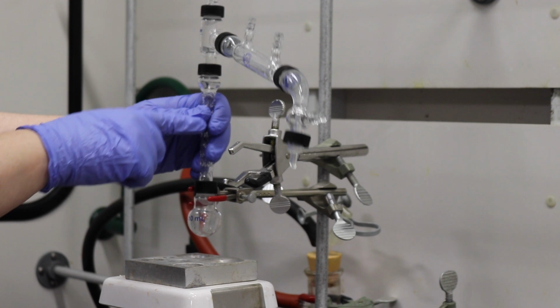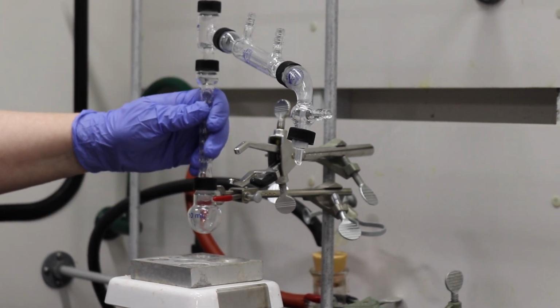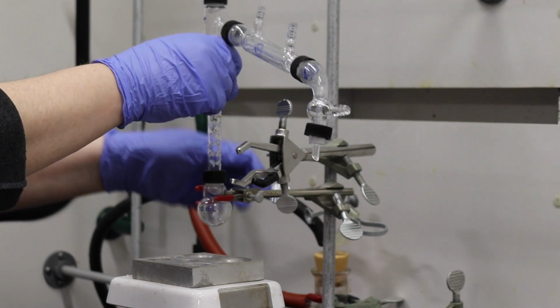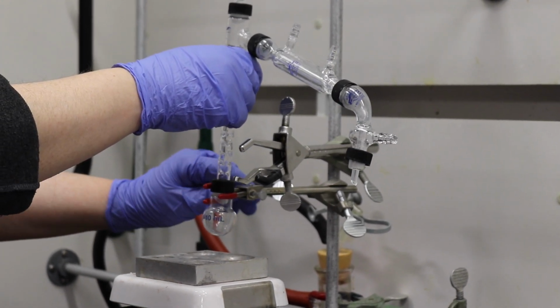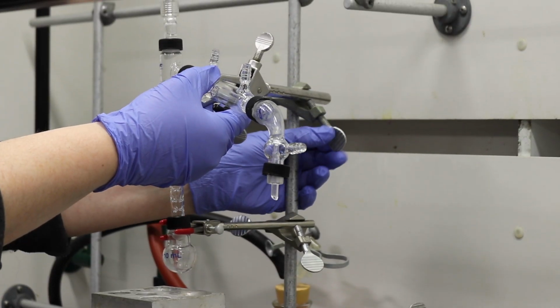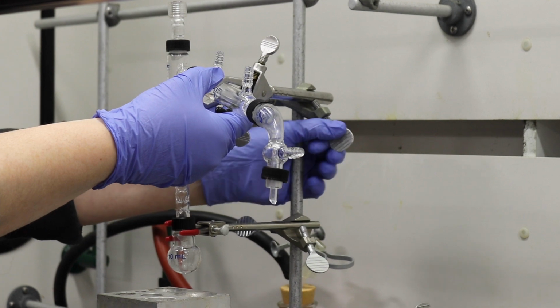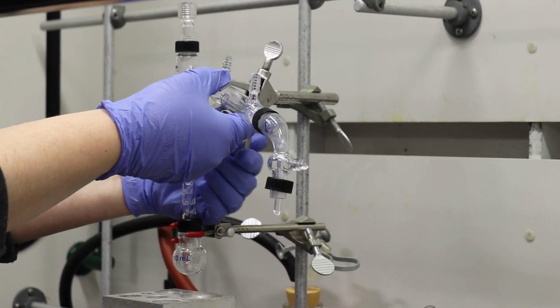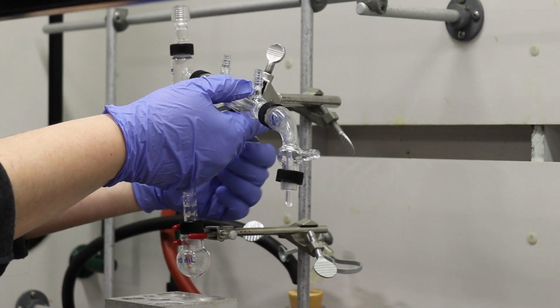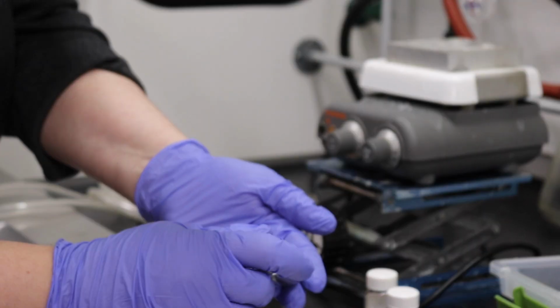But as you look at it, you can see that the bigger clamp is too low for the condenser, and that's fine. So what we have to do now is clamp our round bottom, and then we have to move our other clamp a little bit higher to secure the condenser. And I show you this because you can move the clamps up and down as you need.